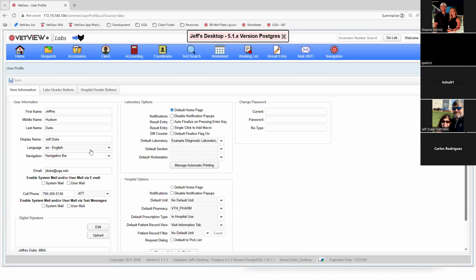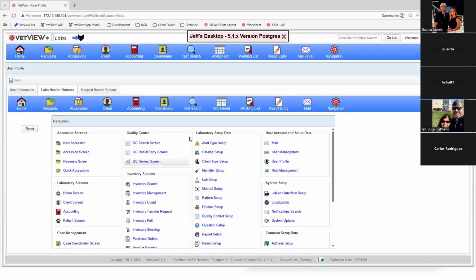Another thing you can do here is also adjust your icon. So going back to navigation here, if you aren't using certain things now, by default, if you don't have privileges to something, it's going to be automatically hidden and not even available.